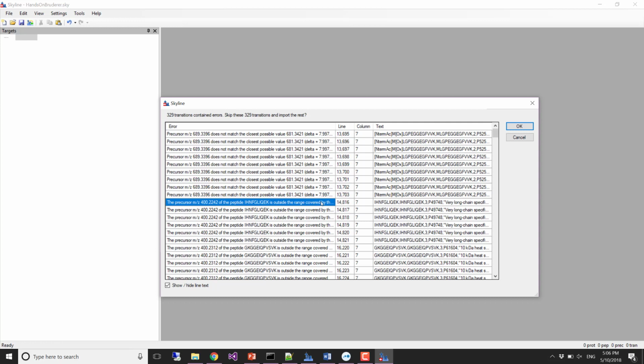We're extracting out of that margin range, or we're expecting that we can, and so we could go back and move the measurement range and pretend that we measured from 399, although we got that range from the raw data file, so we didn't actually measure 399. But we could go back and pretend we did, and then we would get all of these and we could go extract out of that margin. So it turns out that if you do that, that accounts for 250 of these are within this 400 range.